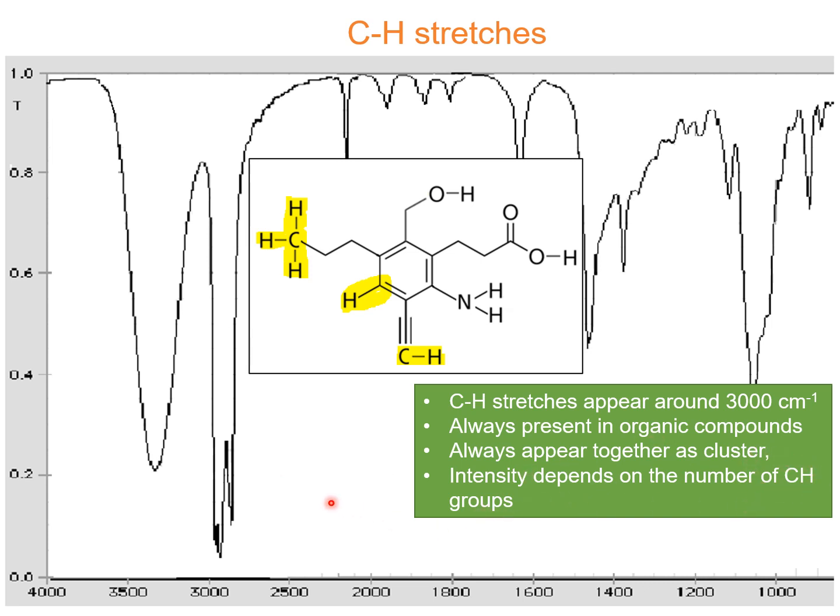If it is just alkyl and it's a long chain compound, then there will be a significant height of this peak. Their intensity in the IR spectrum means the height of this peak from the top, how much it extends to the bottom. So by looking at the height of this peak, you will also come to know whether this compound contains a lot of CH or only very few.